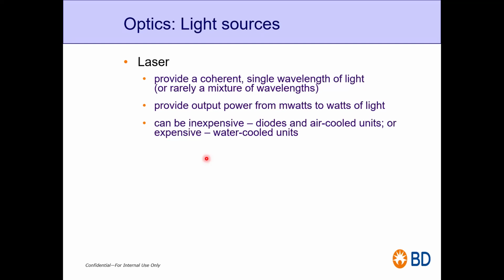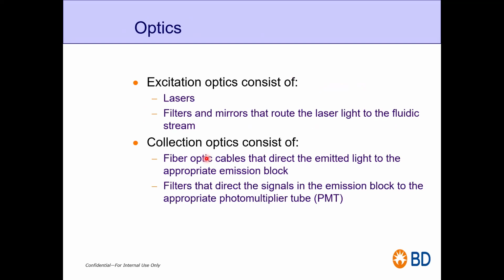Now I have a question. Though you can see it here, I want to see how many of you can answer. We are using laser here. Why not LEDs? We can use LEDs instead of laser, right? But why laser?